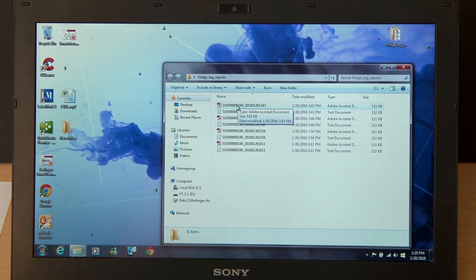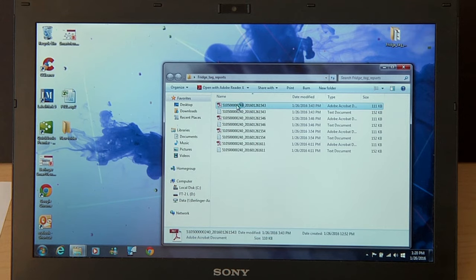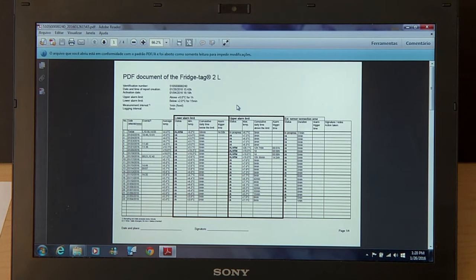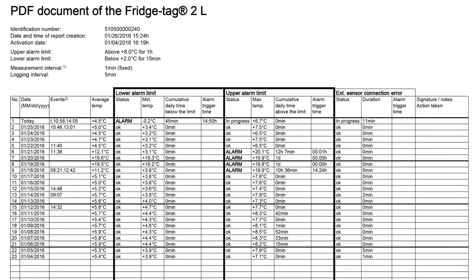Now we can double-click on the PDF report, and we may want to increase the size of it. I change it to 85% to see on screen.